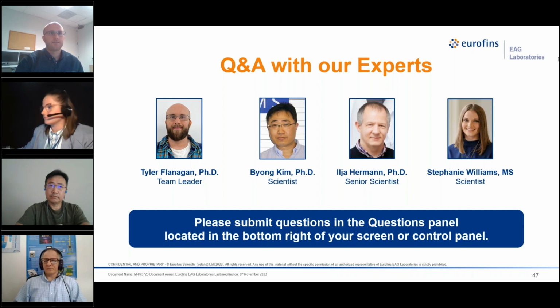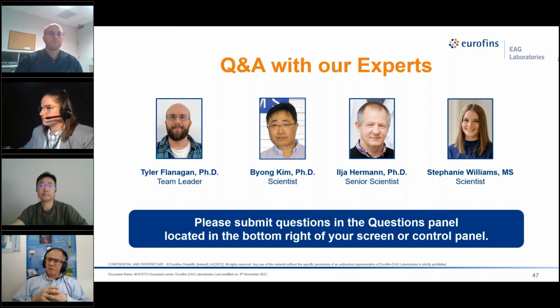It gets a little worse once you get into phase shift and really smooth samples, but it's a very accurate technique. Okay. And Ilya, we have a question. How do you characterize material properties such as the Young's modulus, and will AFM results correlate with bulk material tests? So first of all, when we talk about Young's modulus, AFM is not the ideal technique. It would be more like nanoindentation. But we use contact mechanics, and our AFMs can also apply force displacement curves, which we can model and extract the Young's modulus.